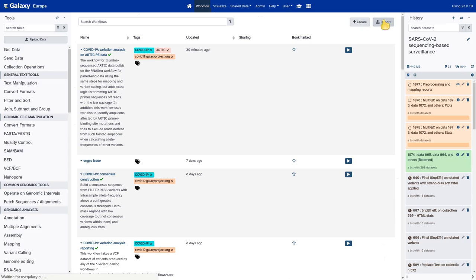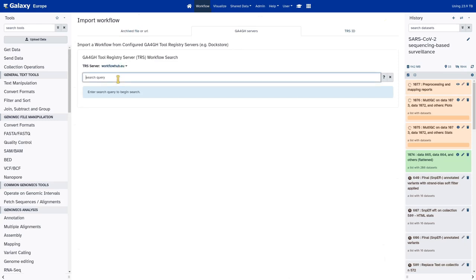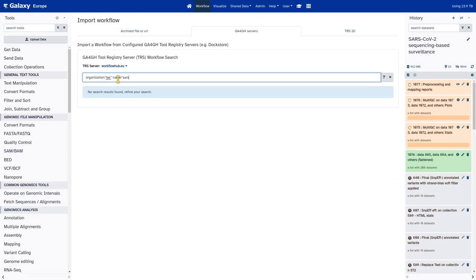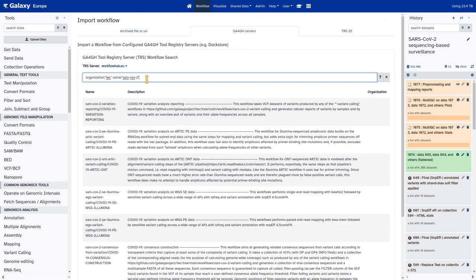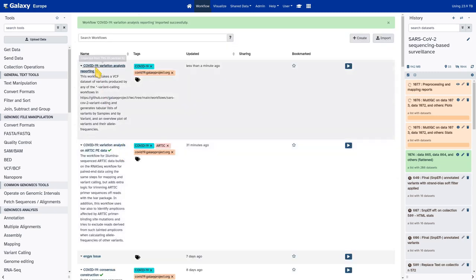Choose WorkflowHub or Dockstore, whichever you prefer. We type our search query again: organization colon IWC, then the name filter. The top hit is actually the COVID-19 variation reporting workflow we want. We expand it, see the different releases available, pick the latest, get it imported into our list of workflows. We're ready to run it.